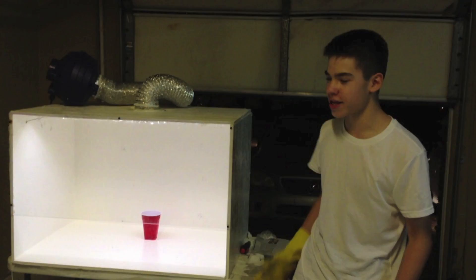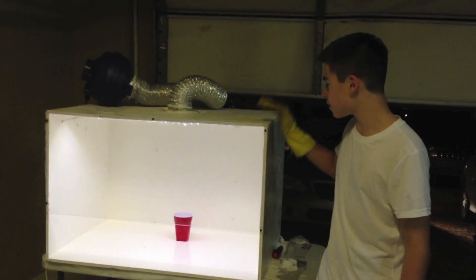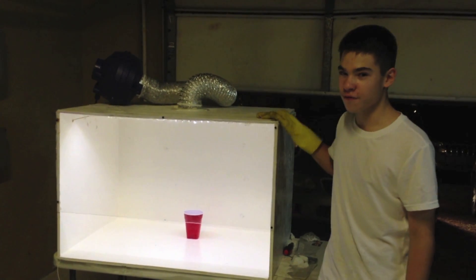I'm Steven, and you're watching Steve Loves Science, and we're here in my garage tonight because I've just finished building my homemade do-it-yourself fume hood.